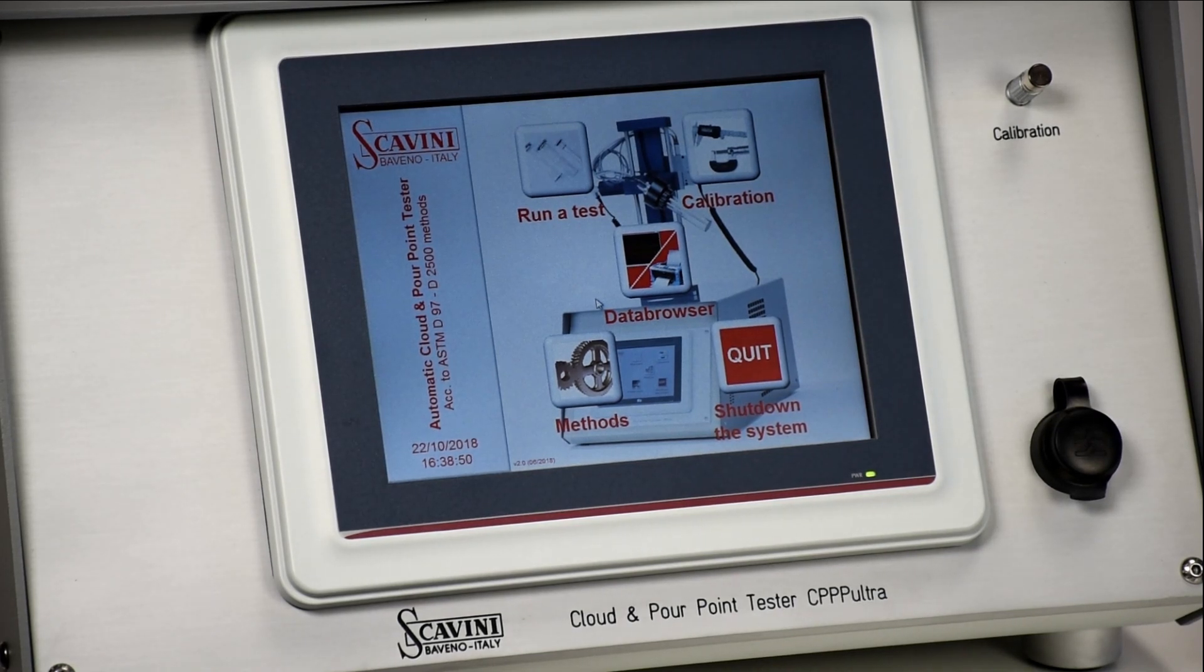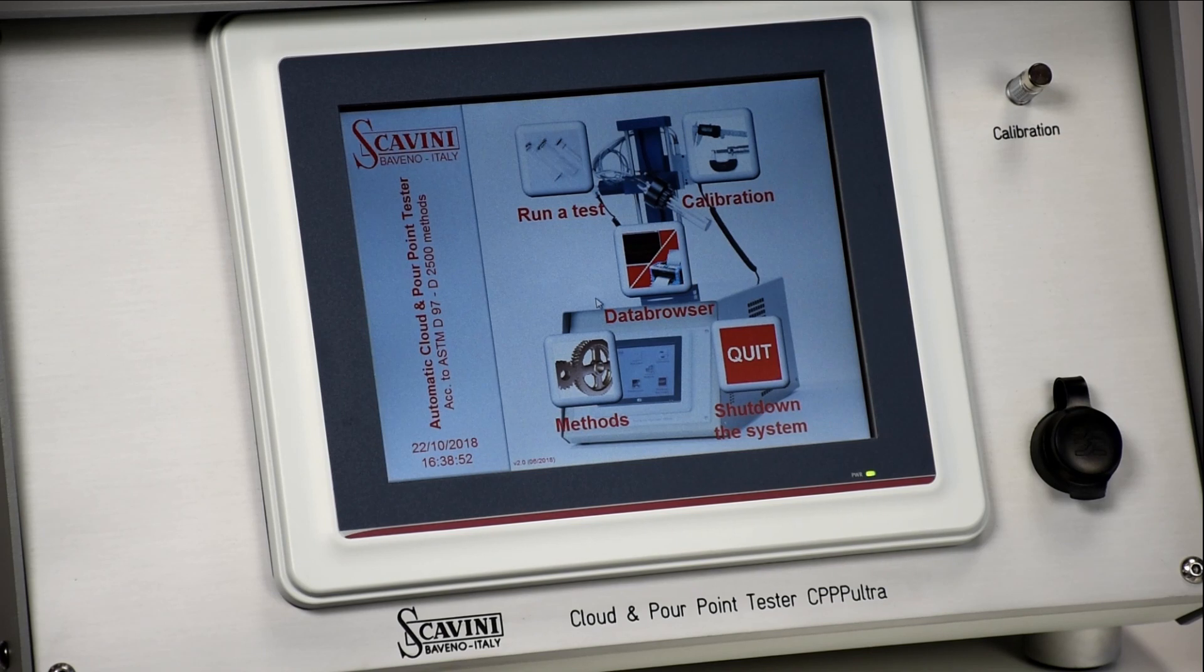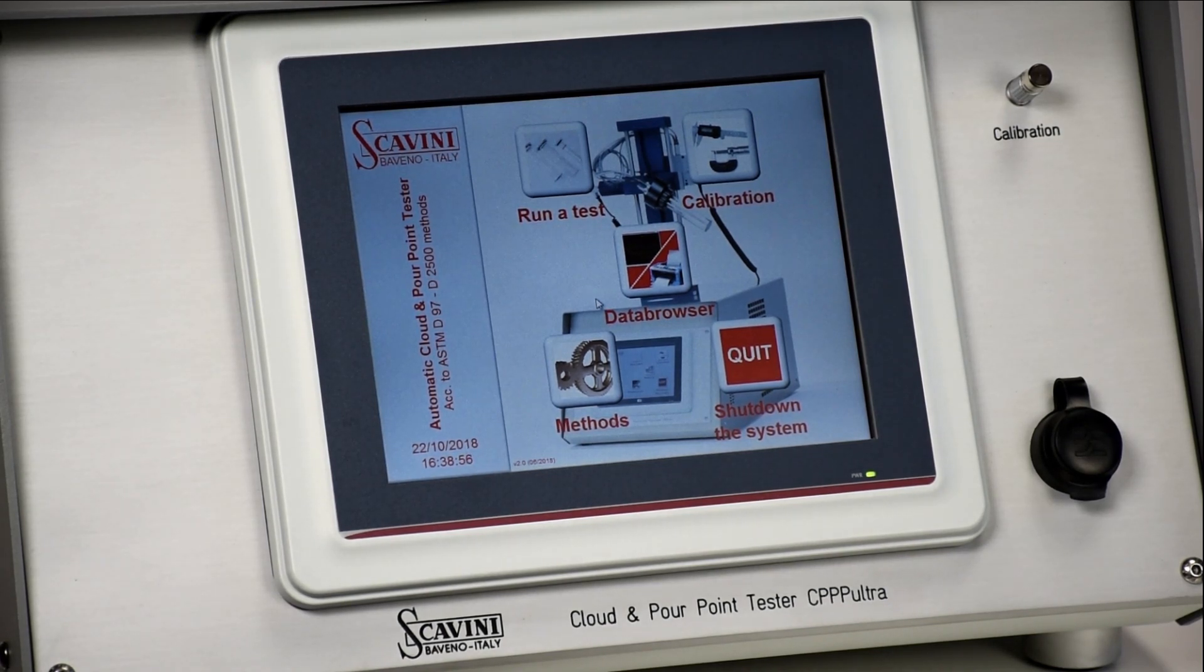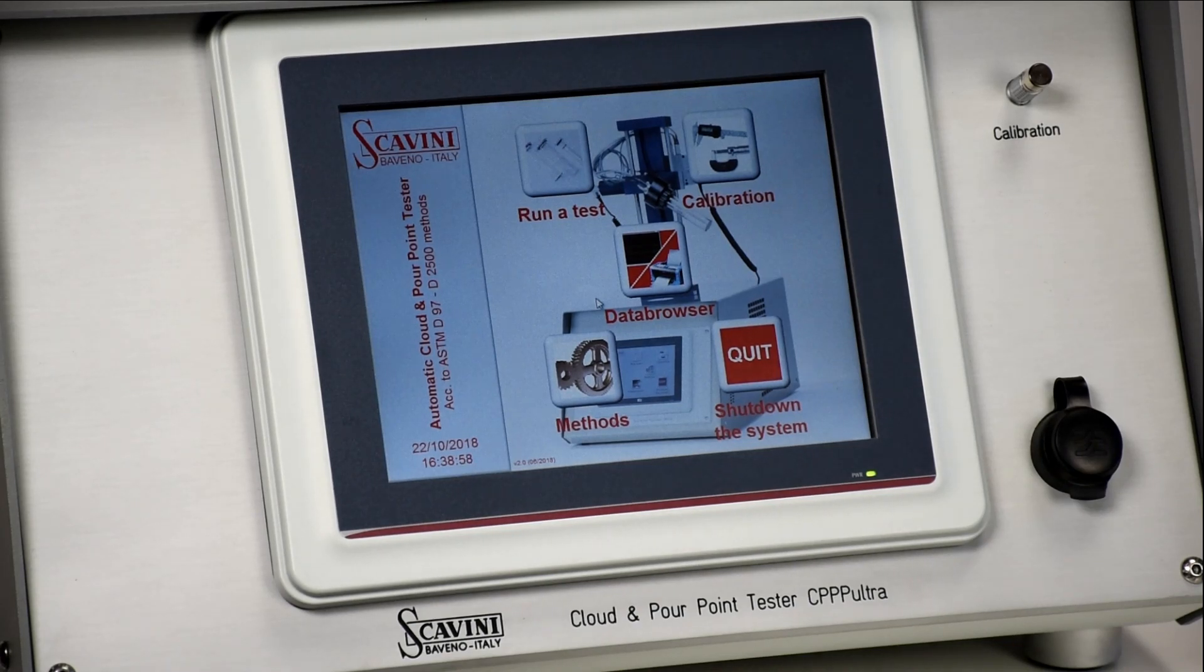One USB on the front panel and one on the back, together with an internet port, permit connecting printers to print reports or to link the instrument to the laboratory network.